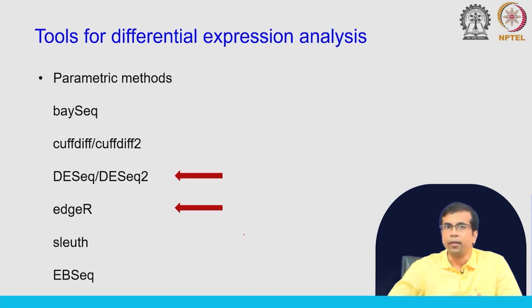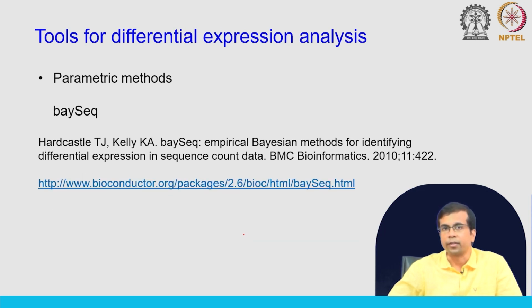Out of these tools, I will discuss DESeq2 in a lot of detail. We will talk about the steps, so you will understand how this analysis works, and I will also mention briefly edgeR. These are the two most popular tools for differential expression analysis. For the rest, I will just give you the references so that you can look up and read.